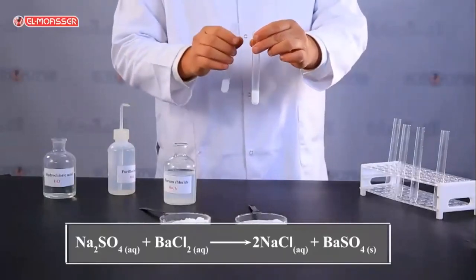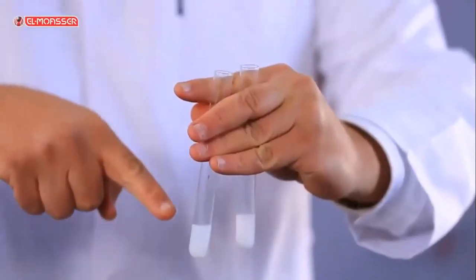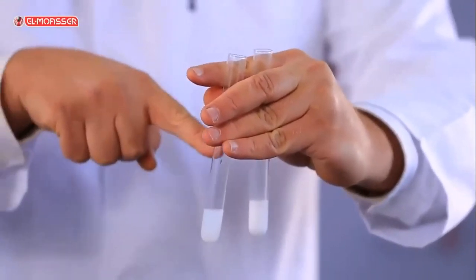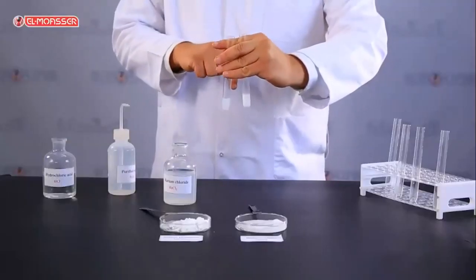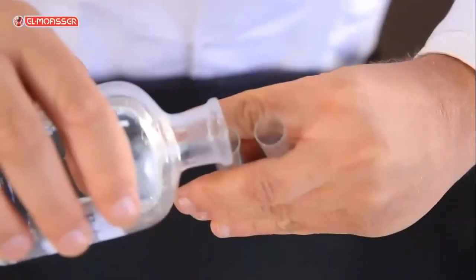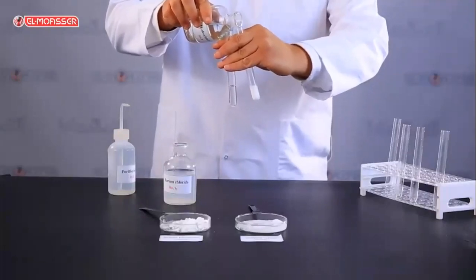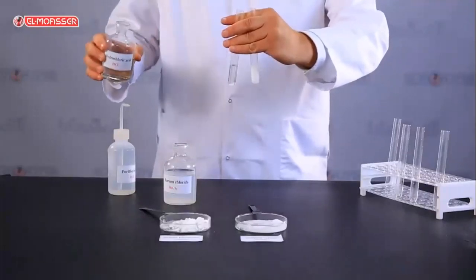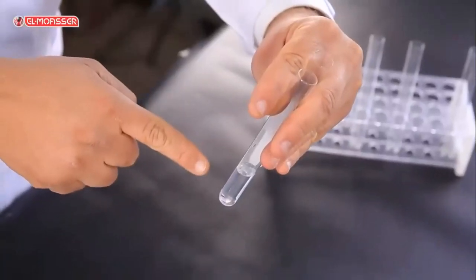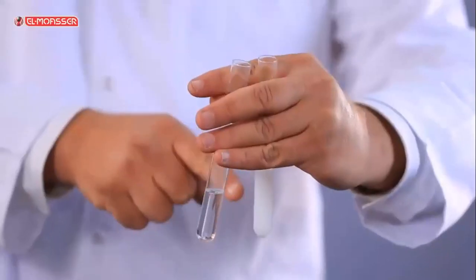The differentiation between the two precipitates, barium phosphate and barium sulfate. To differentiate between the white precipitate of barium phosphate and the white precipitate of barium sulfate, add to each of them diluted hydrochloric acid. What do you observe? The precipitate of barium phosphate is soluble in diluted hydrochloric acid, while the precipitate of barium sulfate is insoluble in it.